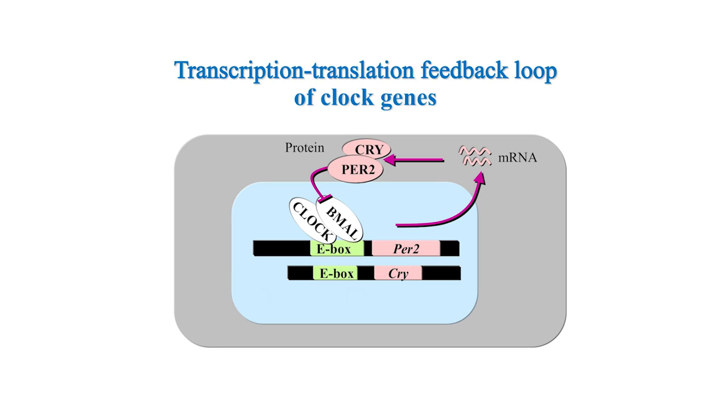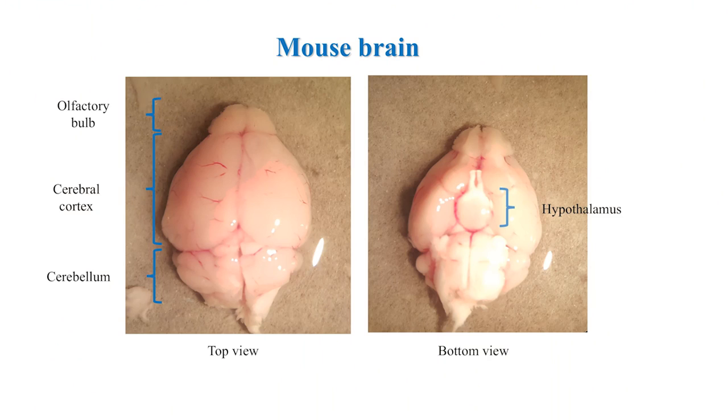To prepare the sample for the experiment, we first humanely euthanize the mouse. We extract the whole brain carefully to avoid damaging the hypothalamus. Brains are stored in ice cold saline. Here you can see the extracted mouse brain.